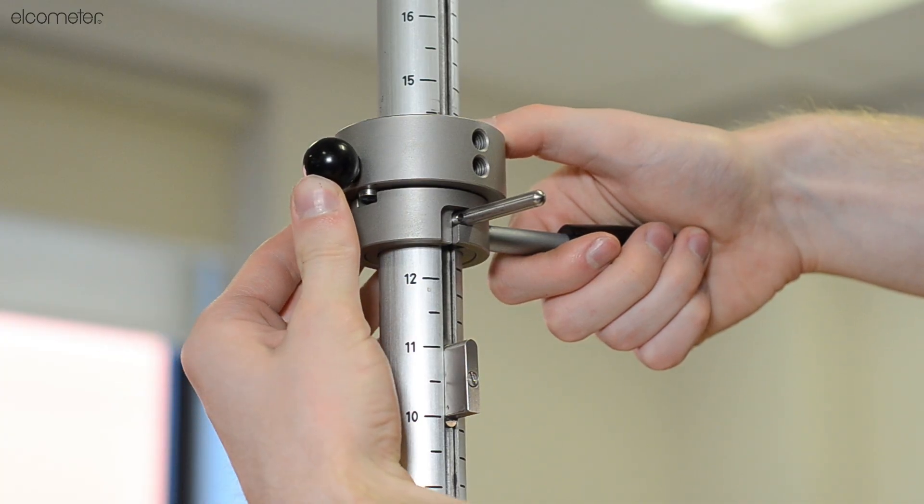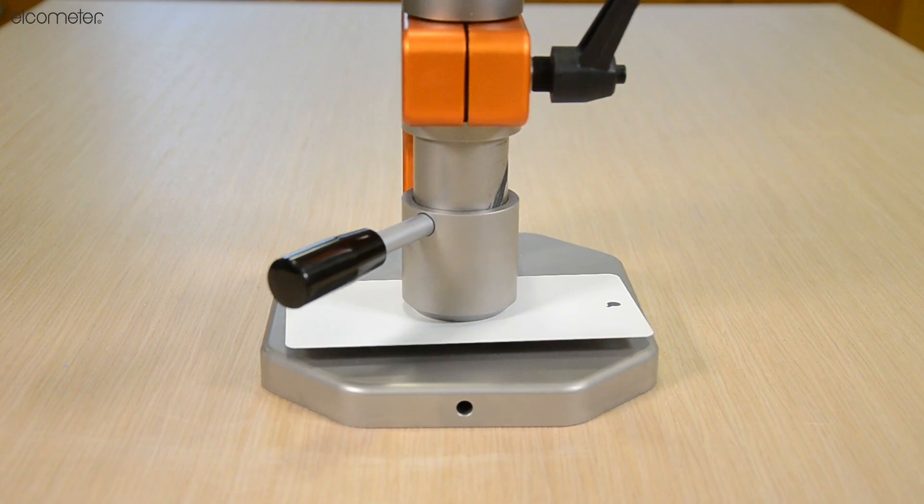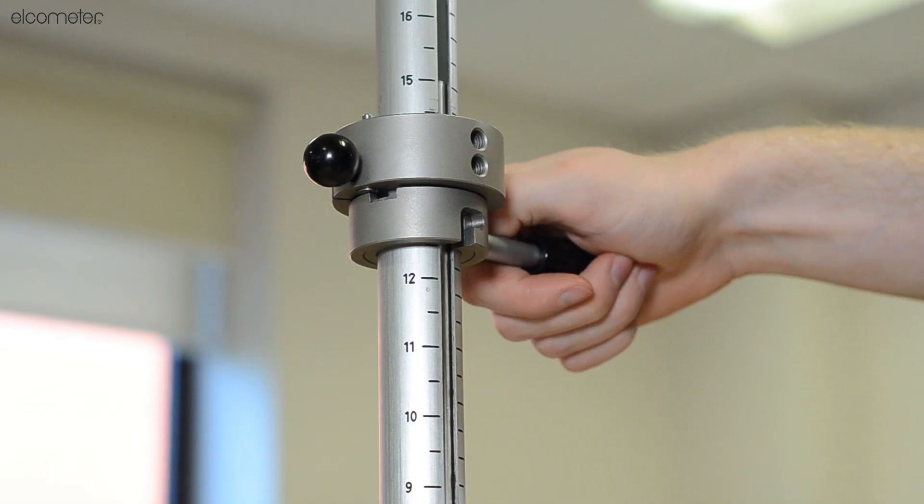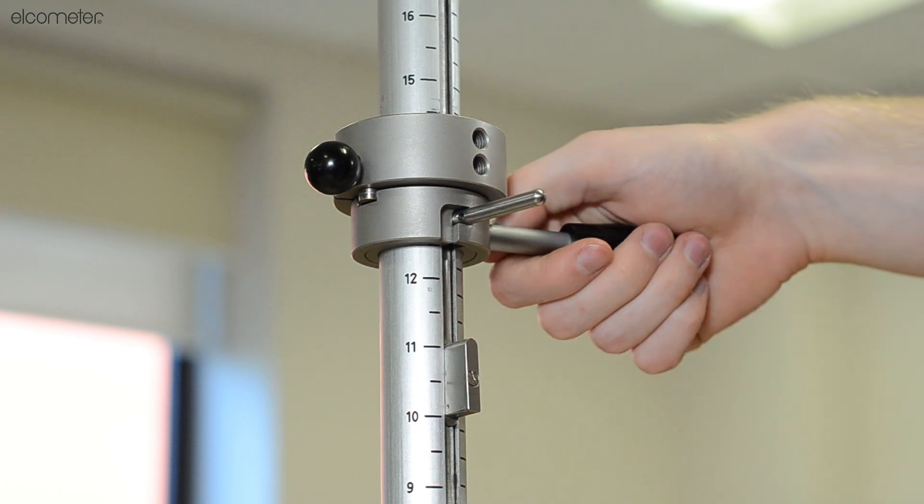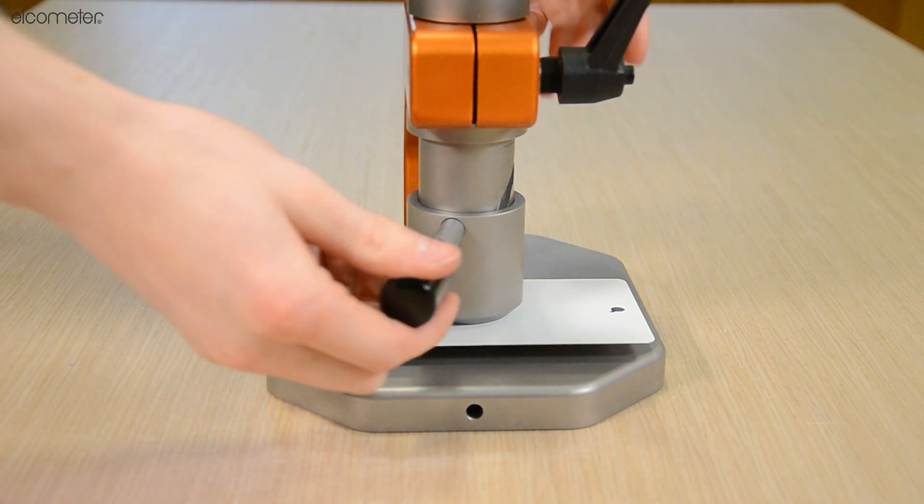Release the weight by rotating the handle on the release collar and the weight will drop. After impact, lift the weight and re-secure it in the release collar. Release the specimen clamp and remove your sample.